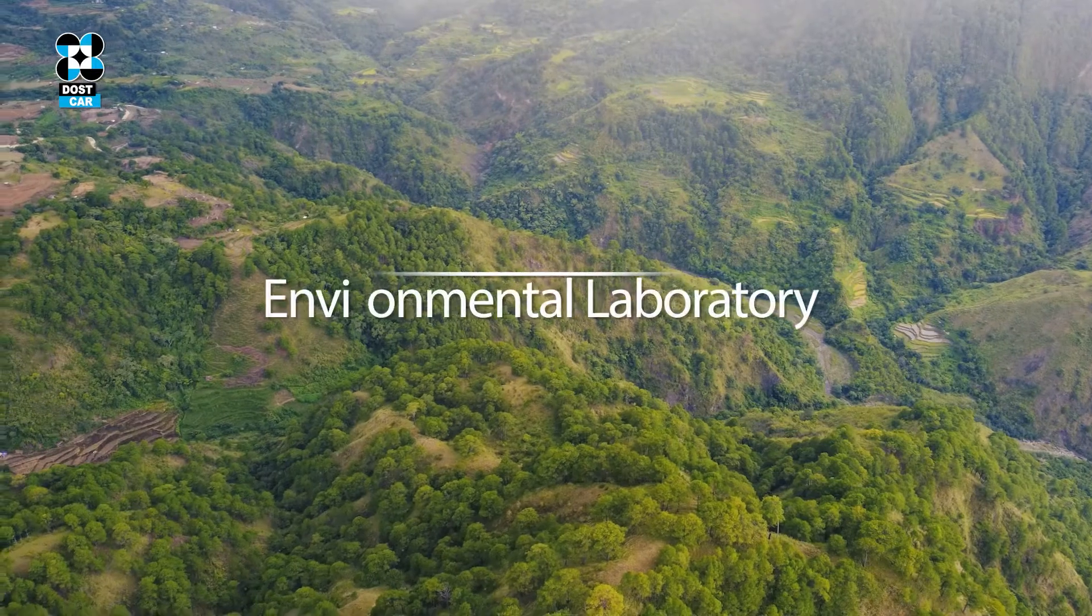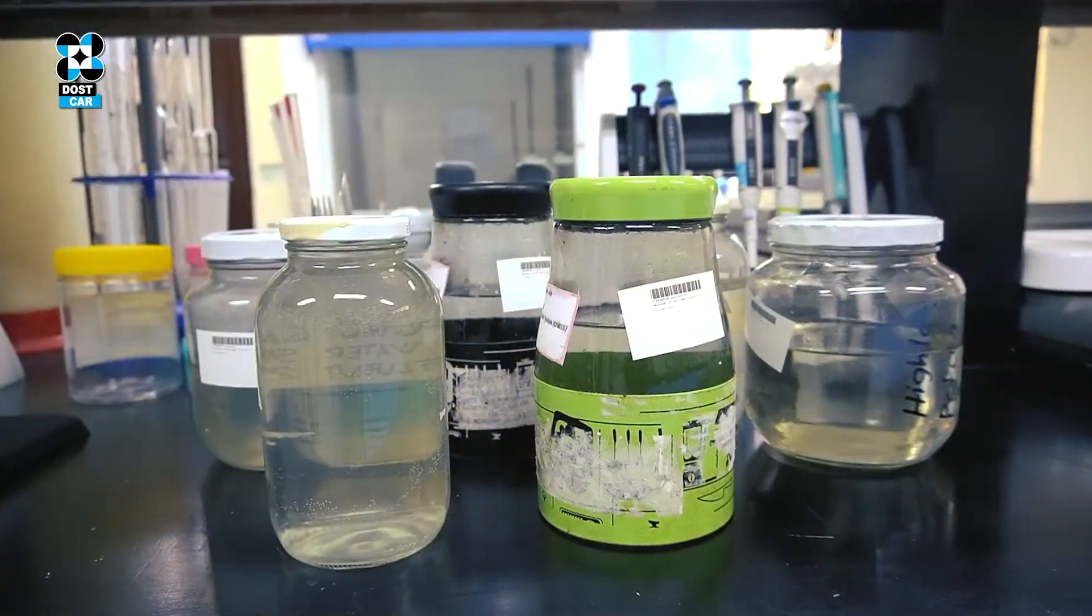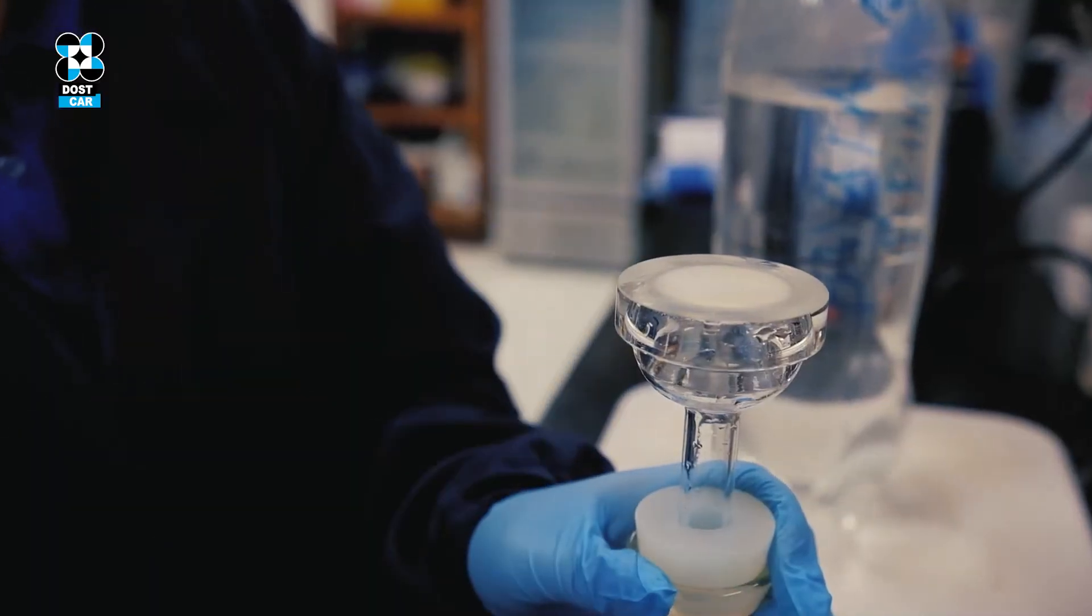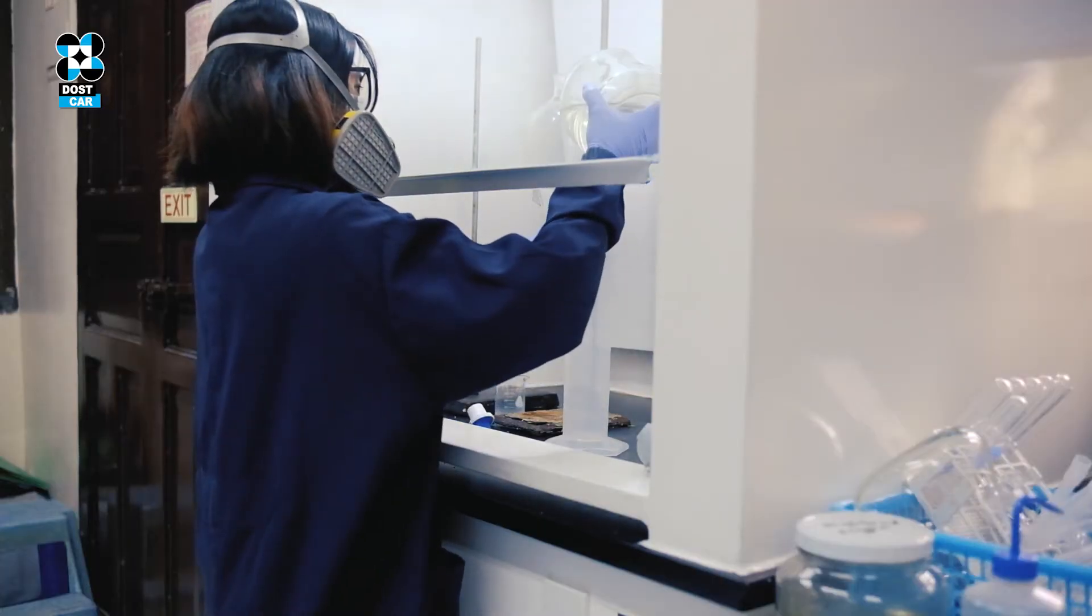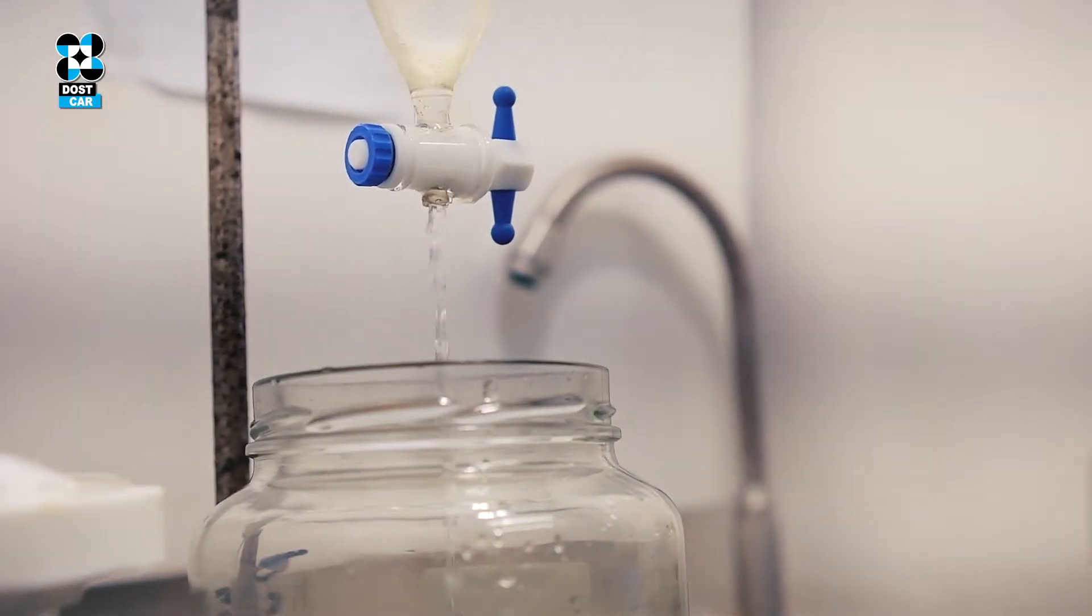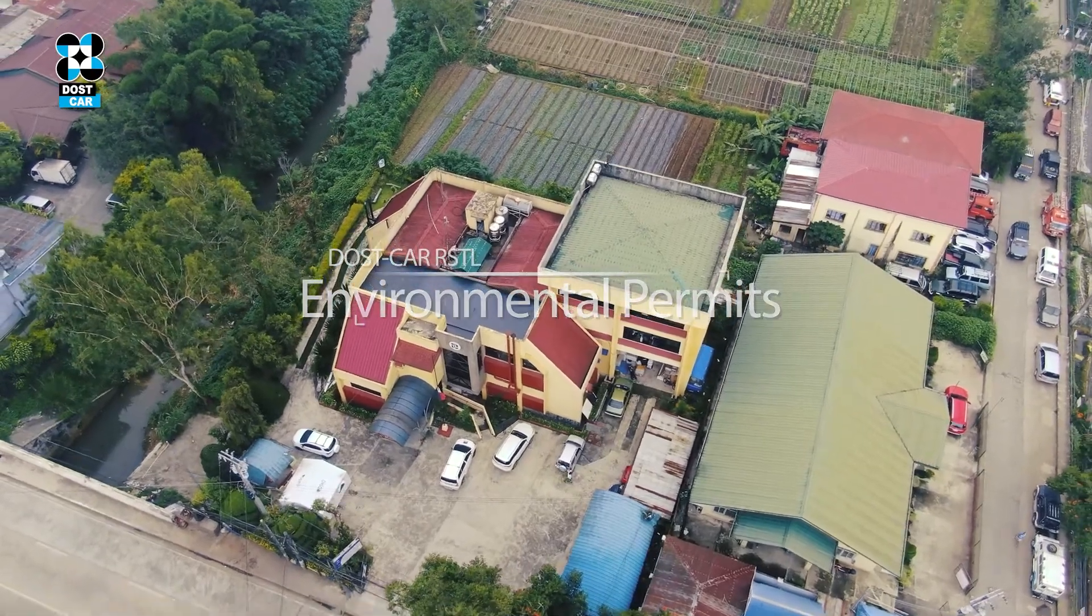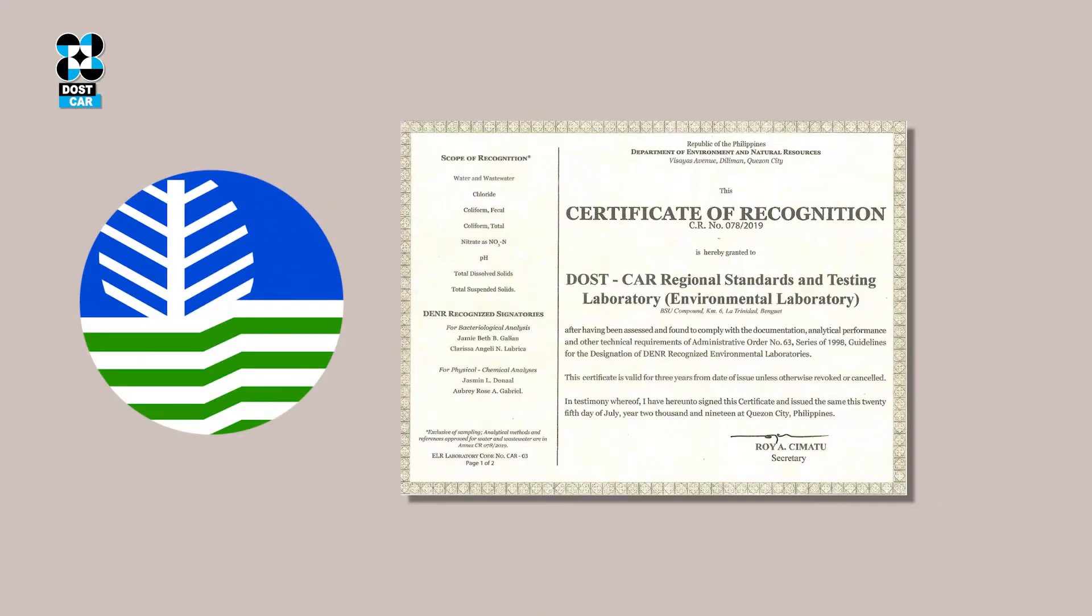The DENR has also recognized the RSTL as an environmental laboratory for physical, chemical, and microbiological analysis of wastewater. Likewise, it is compliant to various environmental permits being monitored by the DENR EMB.